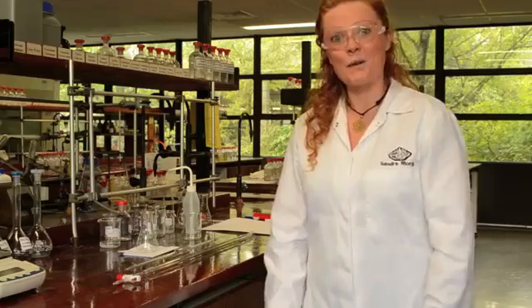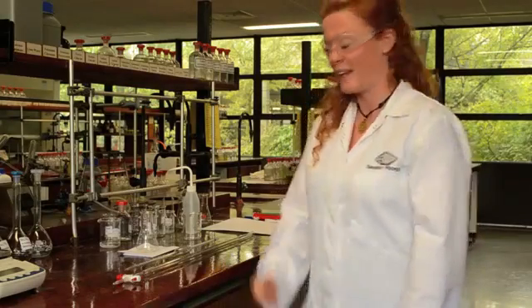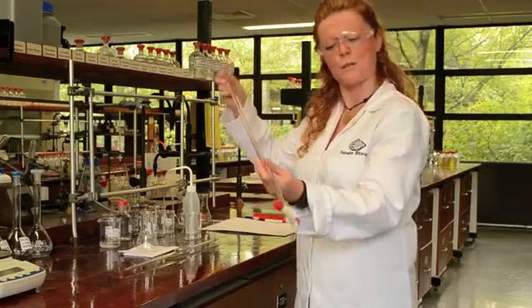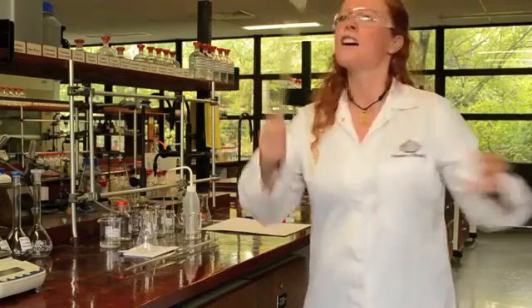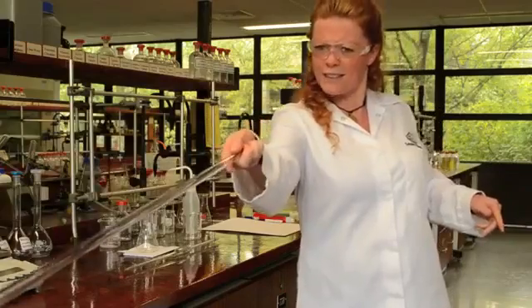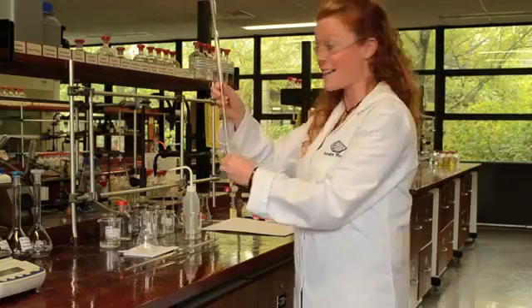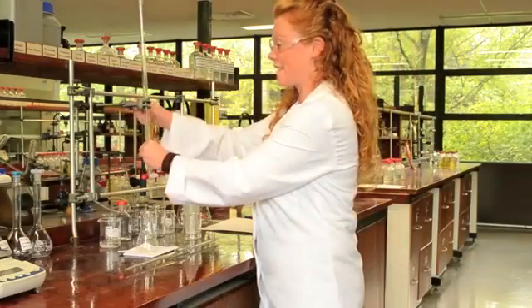There are two important pieces of apparatus used in a titration. The first being the burette. Now, it is possible you could mistake this for some kind of a fencing sword or something, but in fact it's not. It is a device for measuring the quantity of acid that's added during the titration.